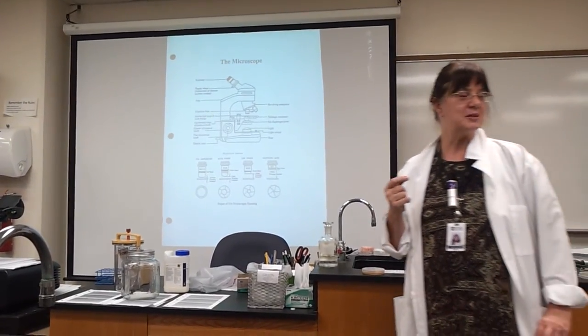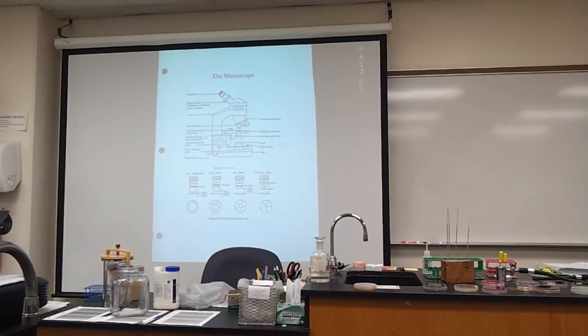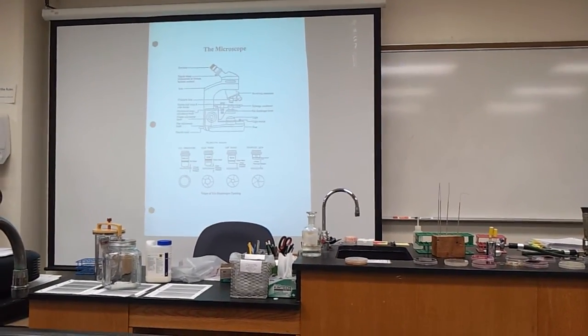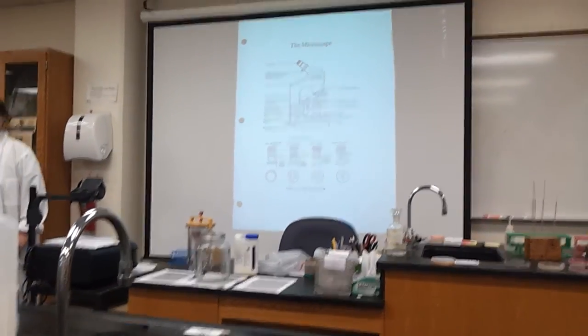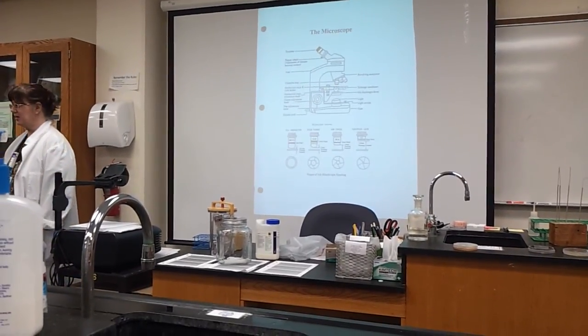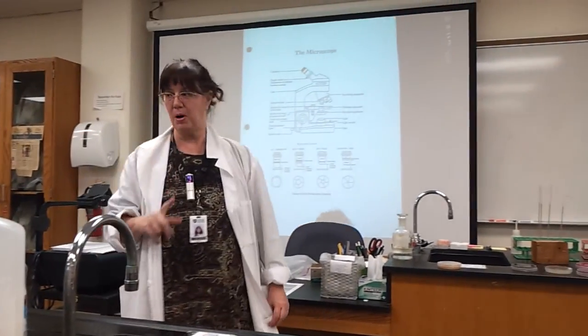Every year, I think somebody sacrifices 2 points or whatever for the partial credit because they just like to do that. There's no electron microscope. You pull it out of a cubby hole and put it down at your station and plug it in to look at. Okay, compound light scope. Know the parts.